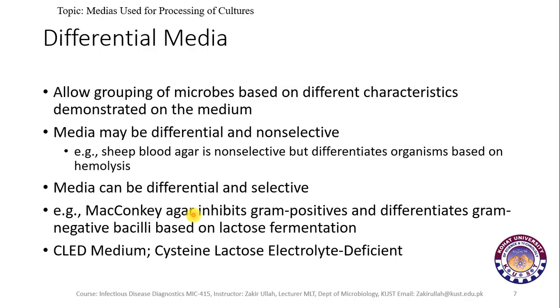CLED medium is another example of a differential as well as a selective medium. CLED stands for cysteine lactose electrolyte deficient medium.